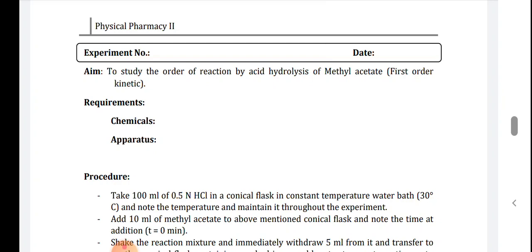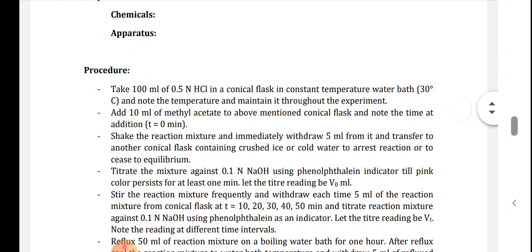The chemicals required for this experiment are: methyl acetate, 0.5 normal hydrochloric acid, 0.1 normal sodium hydroxide, and phenolphthalein indicator. Apparatus required includes glass apparatus such as a burette, pipette, beaker, and measuring cylinder.